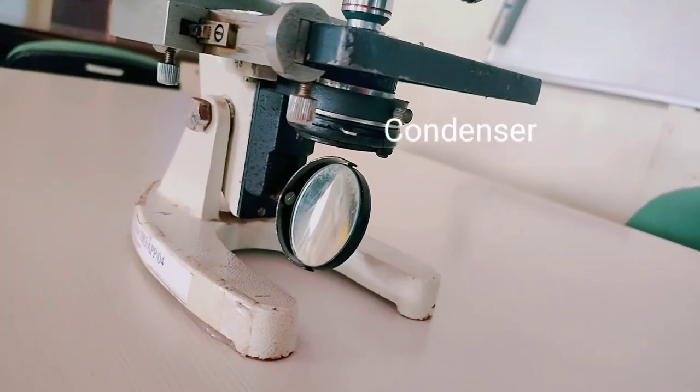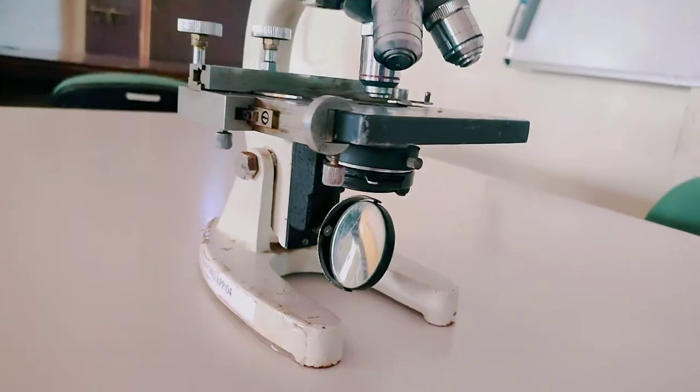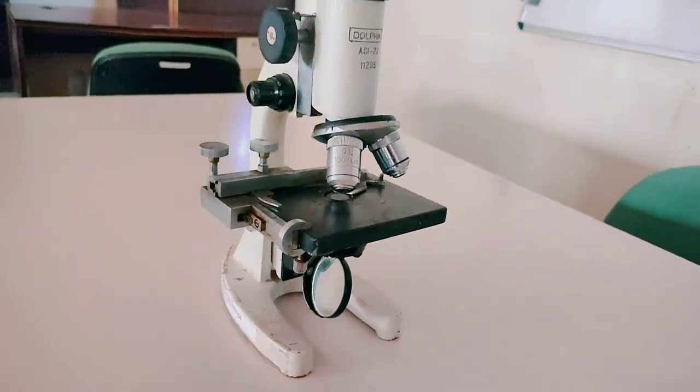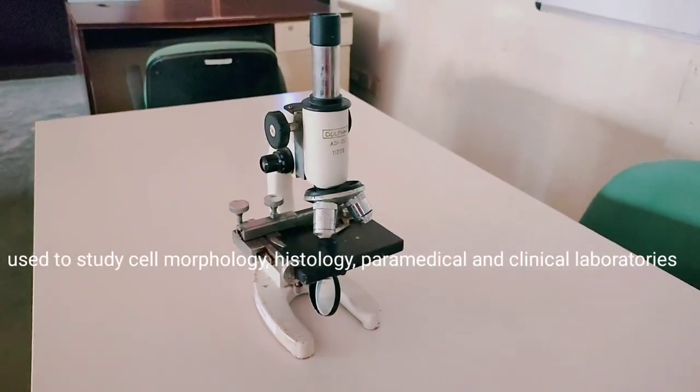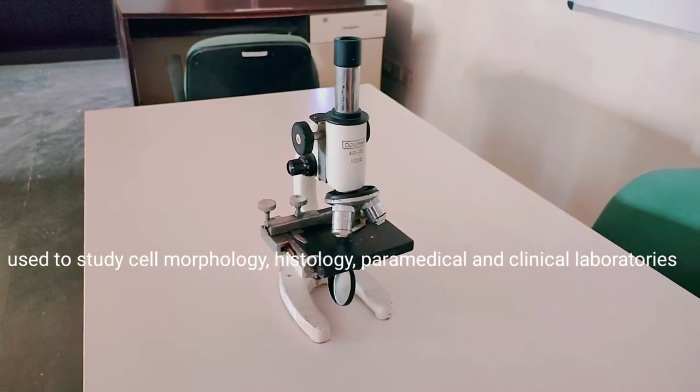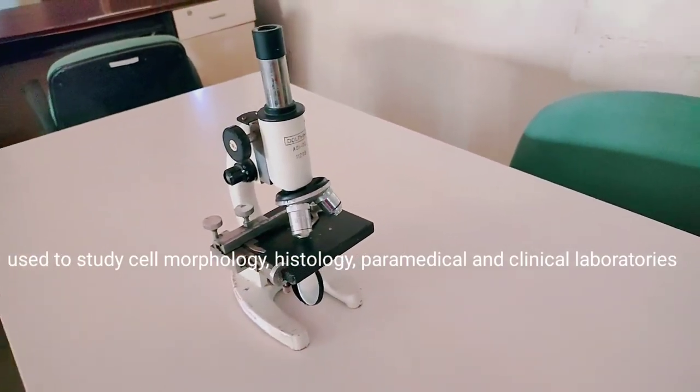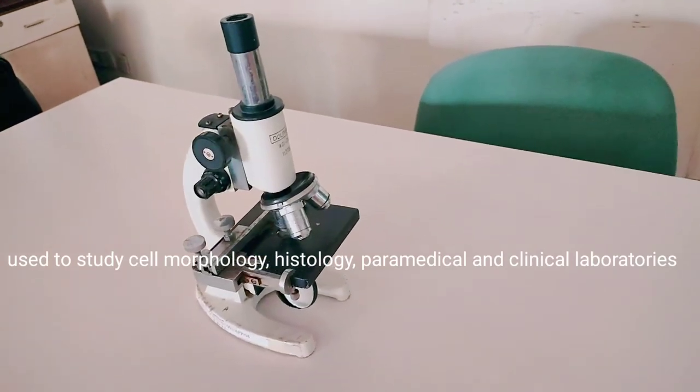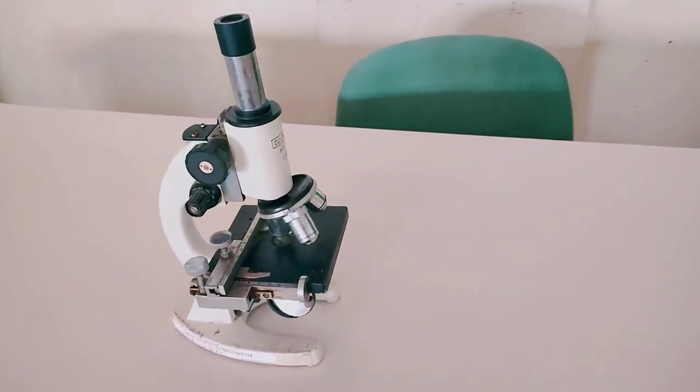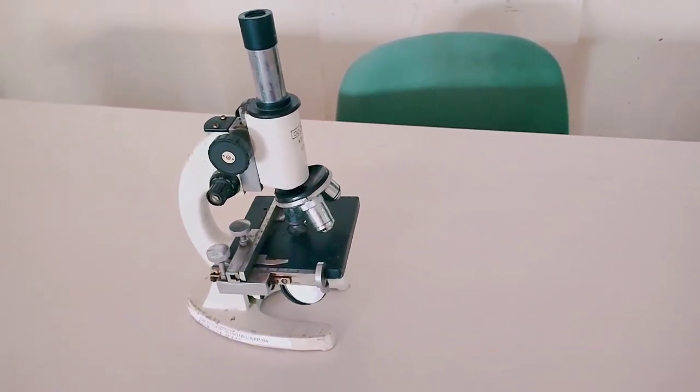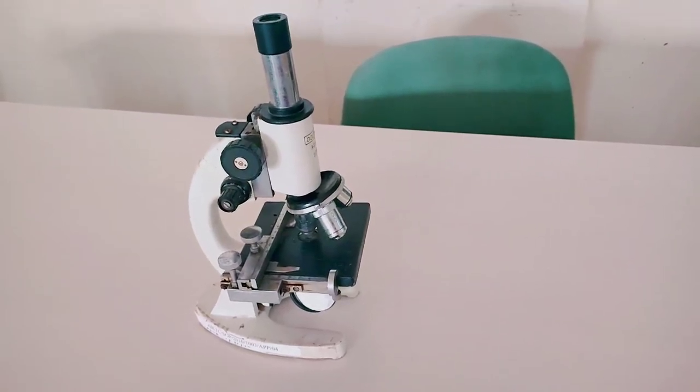The compound microscope is used to study cell morphology, histology, paramedical and clinical laboratories. A microscope helps us to see microscopic objects that are too small and invisible to see with the naked eye.